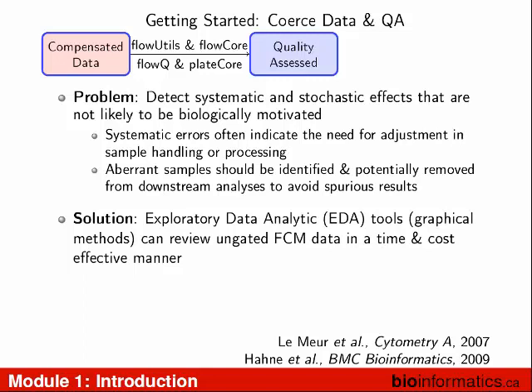Because the last thing you want to do, and I have been the supervisor of somebody who's done this, is this: we spent all this time analyzing a data set, trying to understand a cancer data set, trying to predict diffuse large B-cell lymphoma. When we did this analysis, it's like, here's a cell population that's standing out. These people now look different than everybody else. And what it turned out is that somebody had swapped a laser on the machine. Because they didn't annotate their data properly, this was not in the FCS file.